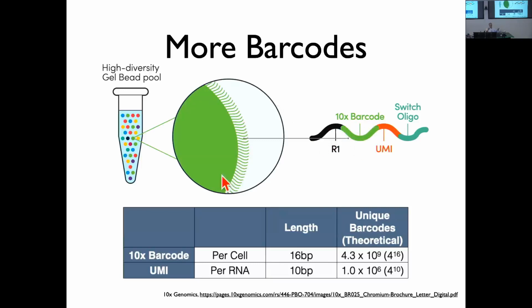So you take your beads, let's say you have 10 grams of beads. Actually, let's make the math easier. Let's say you have 40 grams of beads. So you divide the beads up into 4 different groups of 10 grams each. And you put each of those 10-gram portions of beads into a different tube or beaker. And you put the ATP analog in one, the GTP analog in the next beaker, the CTP analog in the next beaker, and the TTP analog in the next beaker. I'm saying analog because they have terminators, just like for the Illumina sequencing, and so only one base can be added. And you're doing this chemically, you don't do it with a polymerase, right? So you have to be a nucleotide chemist to know how to do it, but that's been figured out.